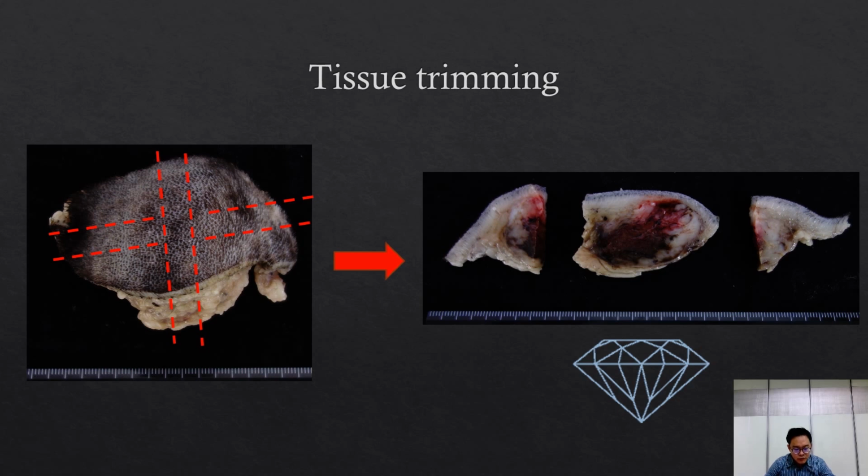After we've done this, we still hold on to all these tissues for at least a month, because sometimes we don't get the greatest cut out of the first one. Or maybe this whole piece is just all necrosis, because a lot of tumors have a lot of dead tissue in them, and there might only be a little viable tumor. And maybe in the first go round we don't find what we need to diagnose it, so we hold on to that tissue in case we need to go back to do more examinations.